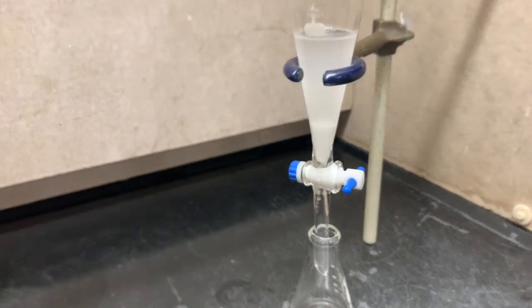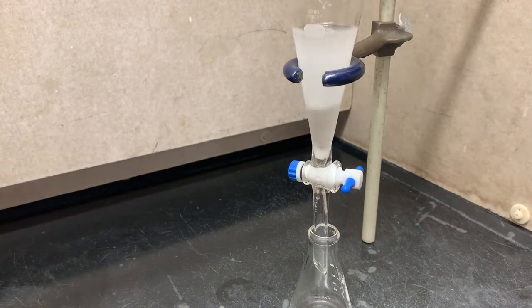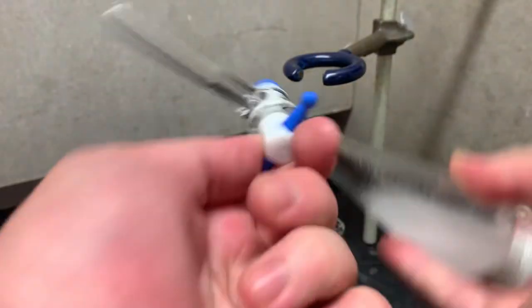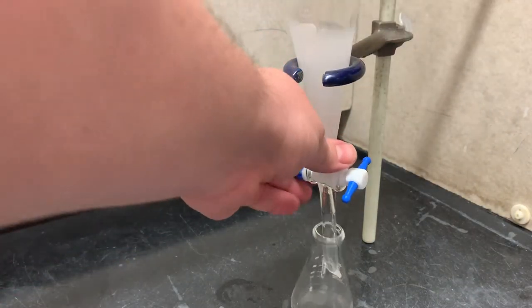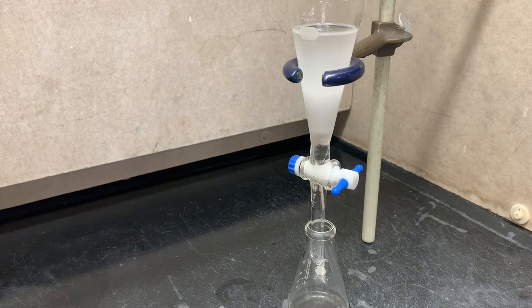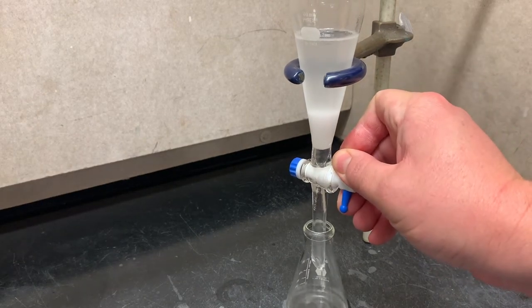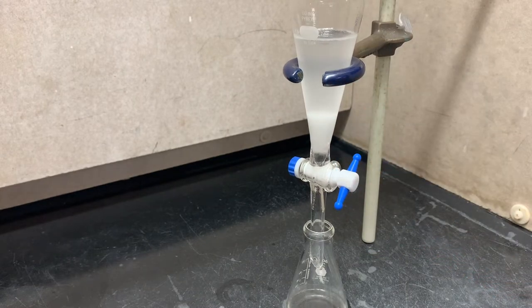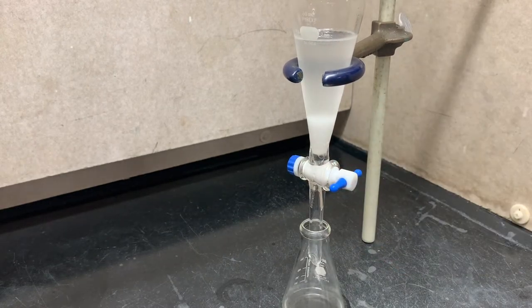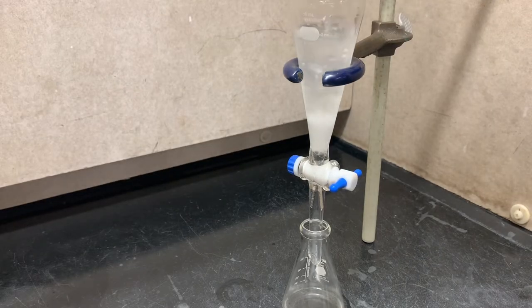Then more DCM, 5 mL again, and repeat the whole thing. One last time, get anything that's left.